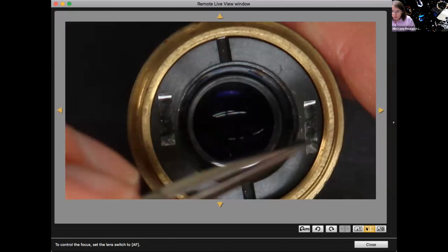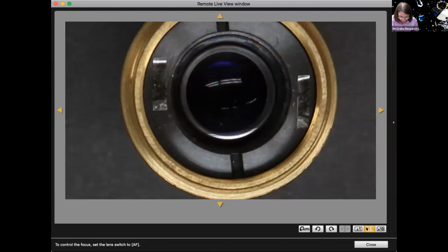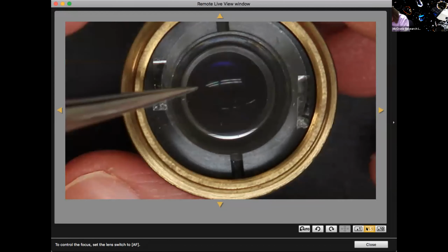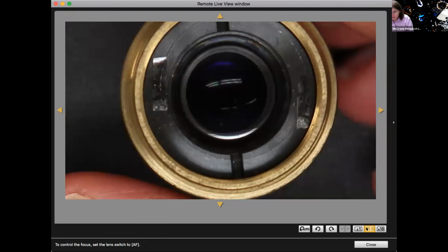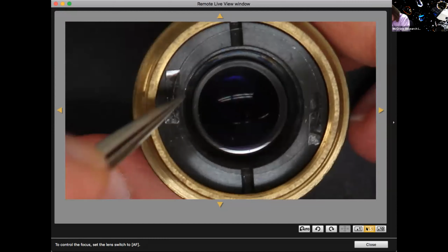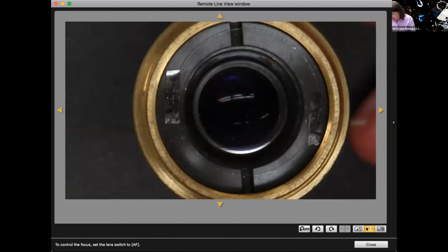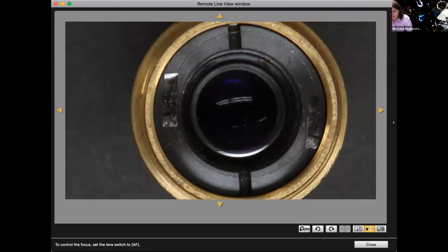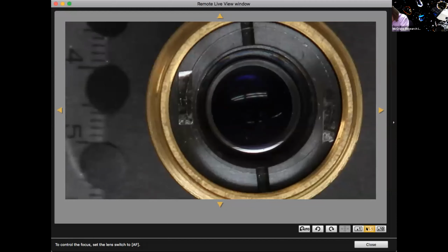So once you've got those two pieces of tape there, then you can add your cover slip in. I like to put the cover slip in first, so that's held in position, because sometimes it's hard to place this absolutely perfectly. And I would then recommend taking one of your stops. So we'll grab one of these smaller ones.